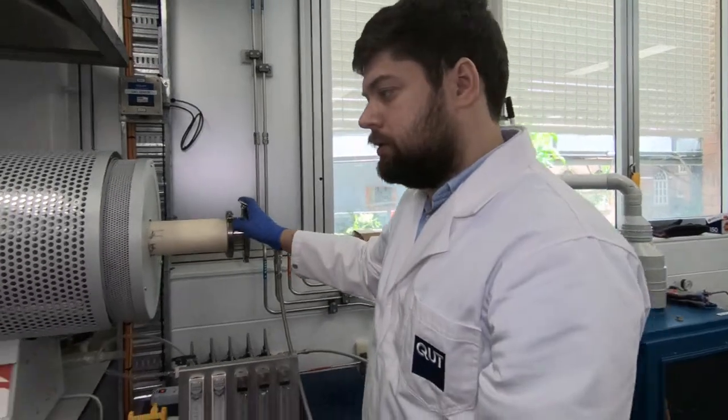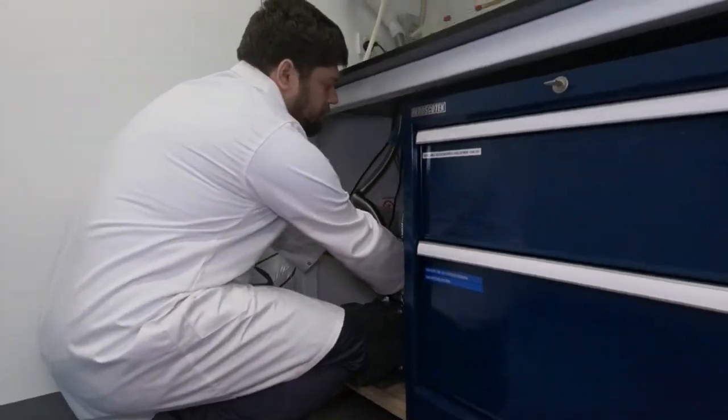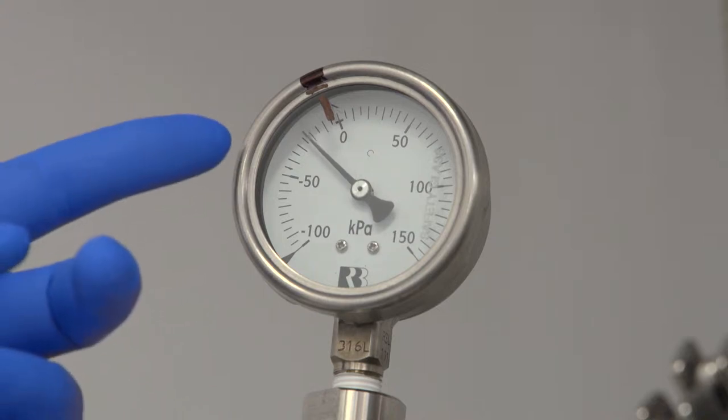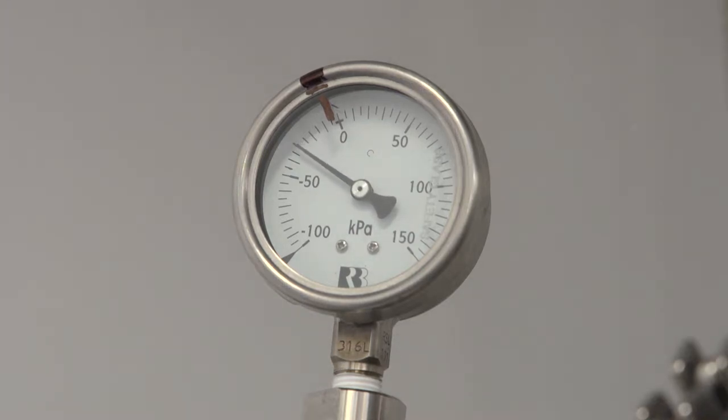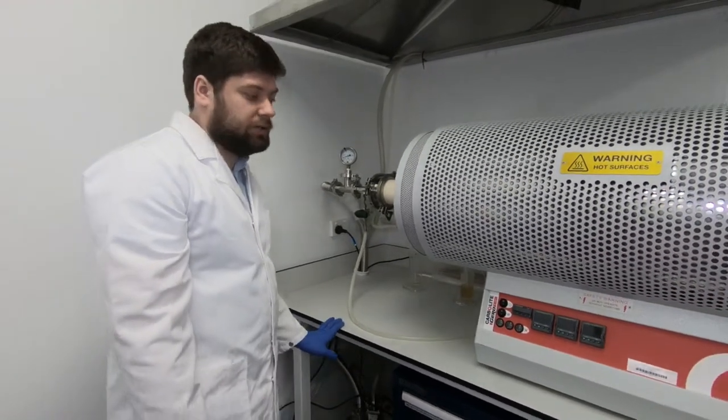Now once the furnace is closed, we can turn on the vacuum pump. Here it is. It's important to do it slowly to prevent spilling of powder. You can see over here on this meter that pressure is going down. And once it's ready, we can start heating.